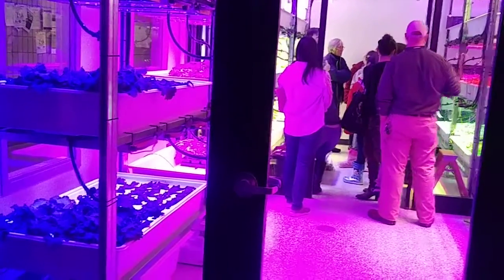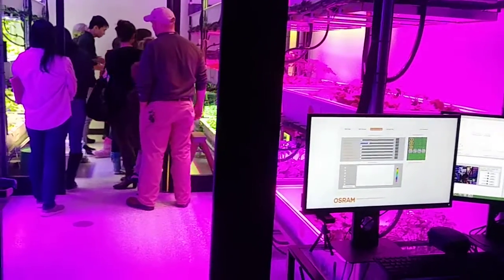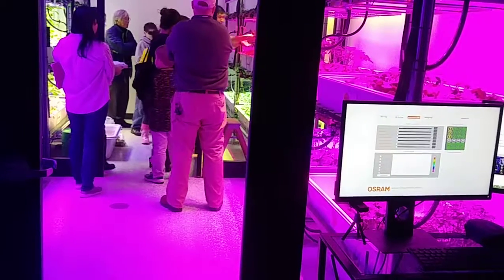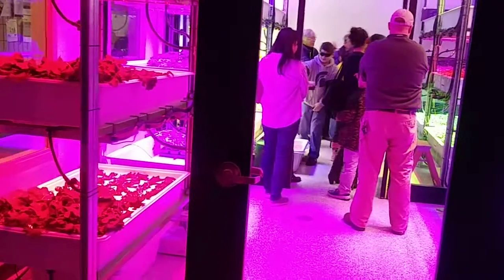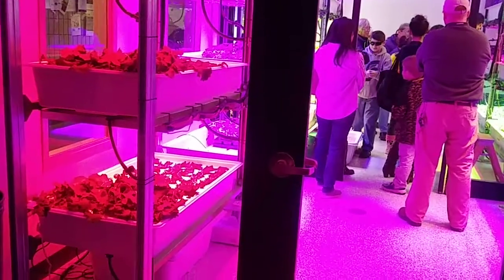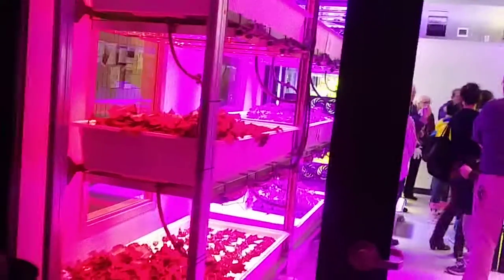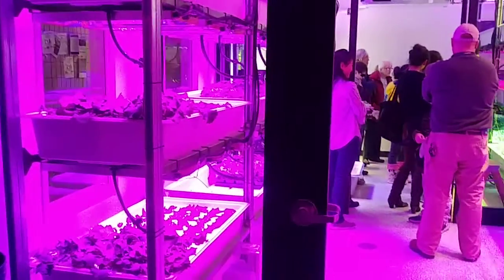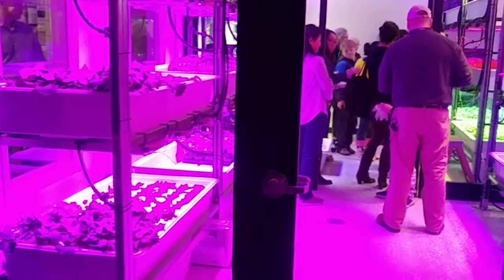So this is the blue light. I don't want it to be too bright because your eyes might feel uncomfortable. And we can also try some red light. We can also mix all different colors of lights together. For example, here we can add some blue over here, and plants can look very purplish under those colors.